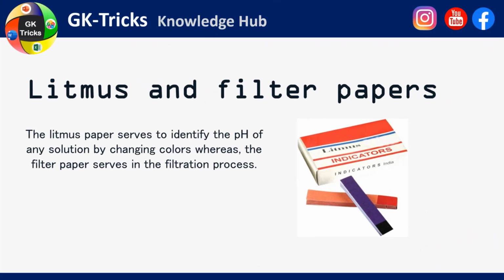Litmus and filter papers. The litmus paper serves to identify the pH of any solution by changing colors, whereas the filter paper serves in the filtration process.